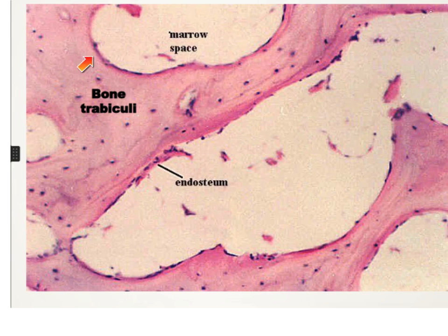Here we have the bony trabeculae, which is formed of the acidophilic bone matrix, and we have these imprisoned cells, which are the osteocytes. So this is the endosteum, a very thin layer, which is rich in osteogenic cells and osteoblasts. Here we have the bony trabeculae containing the matrix as well as the imprisoned osteocytes.